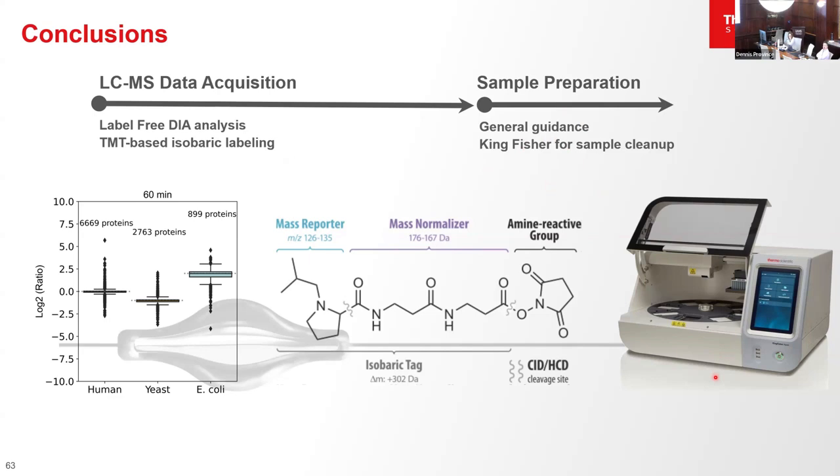So this is amazing. I'm happy to see you can measure over 12,000 proteins. That's amazing. My question is, how do you compare yours with other platforms like Olink, SomaScan, in terms of the sensitivity, reliability, and validation? The reason I'm asking is we have a lot of samples we want to do proteomics with. So I'll be checking a lot of different platforms, and I even send samples to Sam to do a pilot test to see how many proteins we can get.